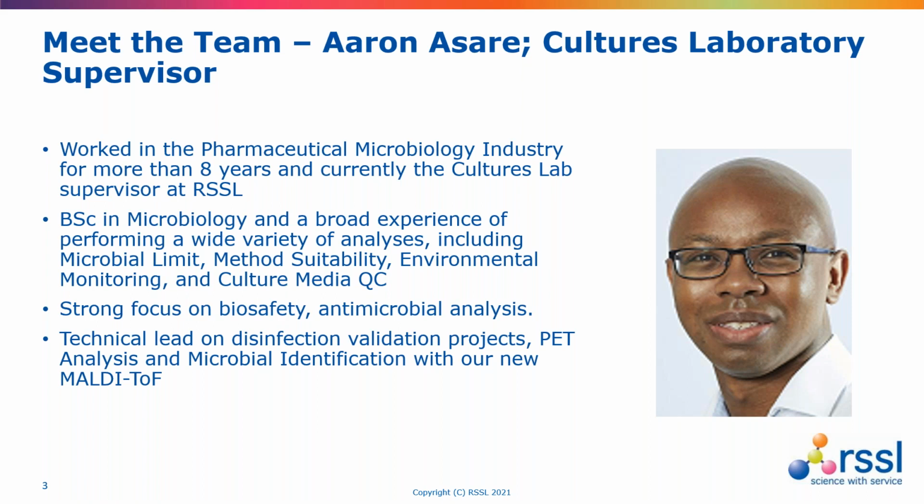Hi. So, Aaron, can you give us a brief overview of what your role in Rssl is? Okay, so my role can be quite varied. On the surface it's essentially supervising our culture laboratory, but that is a combination of supervising the analysts within the laboratory and supervising the analysis that we do. So as you mentioned, disinfection validations, preservative efficacy testing, identifications, media QC and so on. I'm also responsible for the support operations for the laboratory, the purchasing, health and safety, those kinds of aspects.